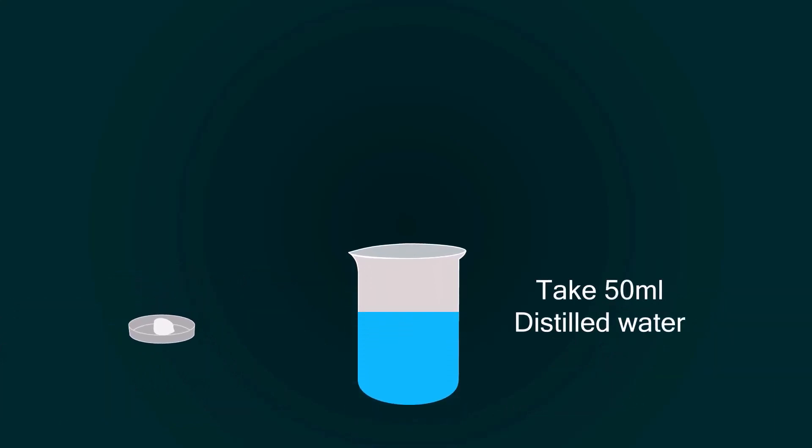Now take some distilled water in a beaker up to 50 ml and put the sodium diphenylamine sulfonate chemical into it. Mix it with the help of a spatula to make a homogeneous mixture.